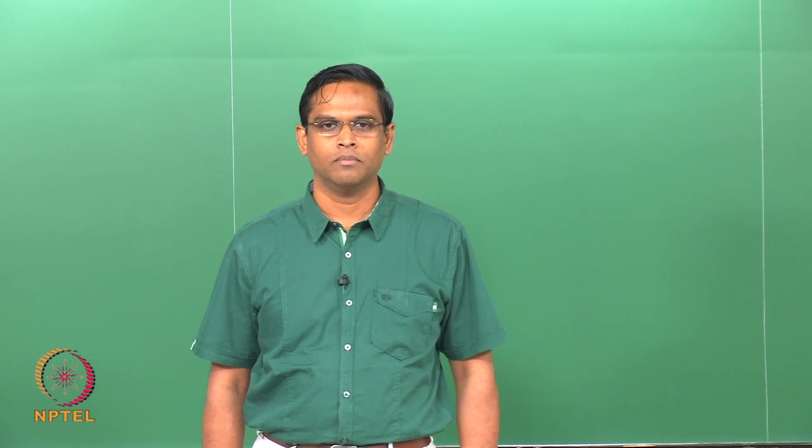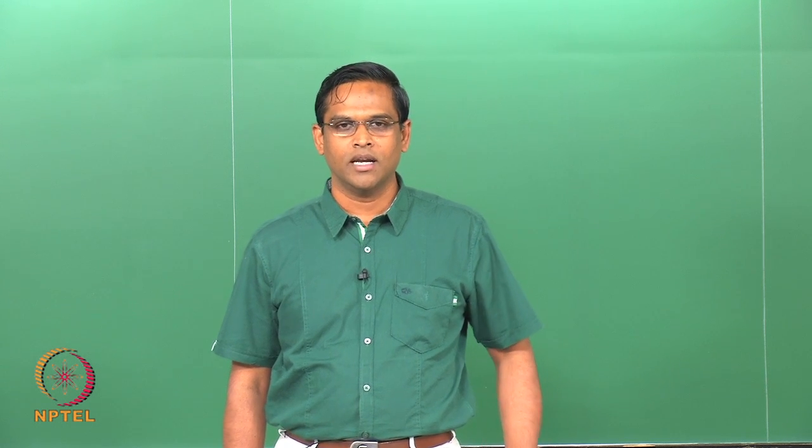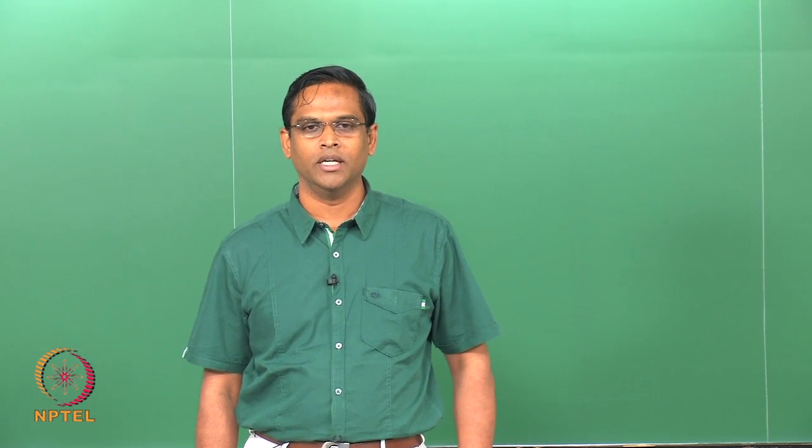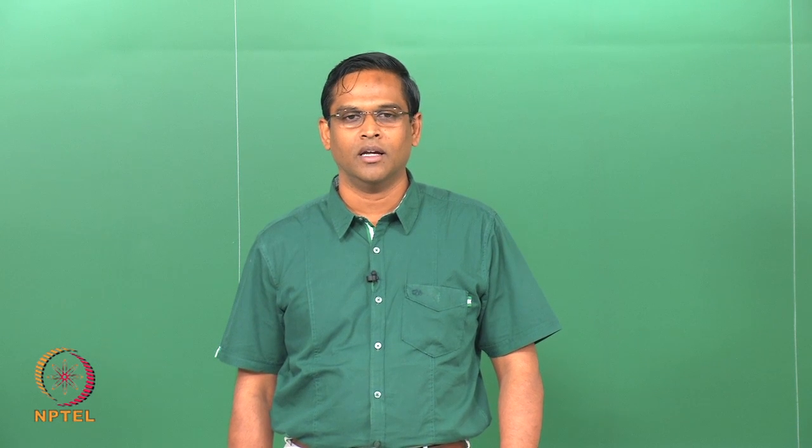Hello everyone, welcome back to this material characterization course. In the last class, we just reviewed the electron optical systems and its governing principles and electron lens design and its analogy with the light optical system. And I mentioned that we will discuss the aberrations in this class.